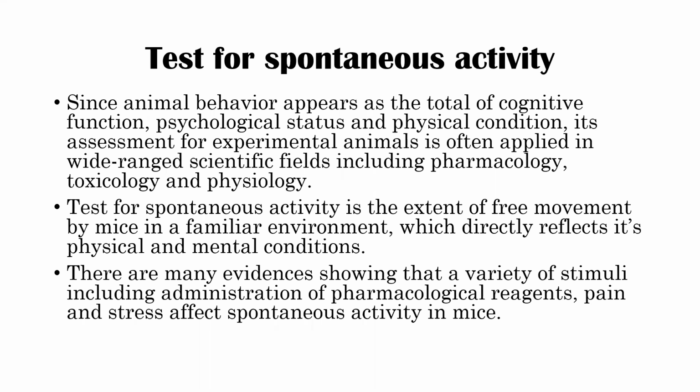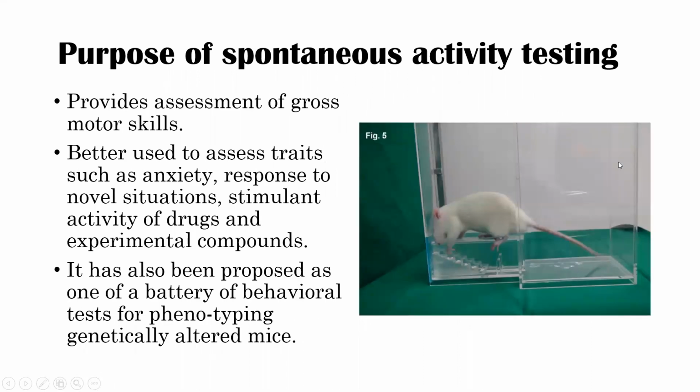The test for spontaneous activity is the extent of free movement by mice in a familiar environment, which directly reflects its physical and mental conditions. So spontaneous activity has its own purpose and significance. Some of the most highlighted ones I've mentioned here.